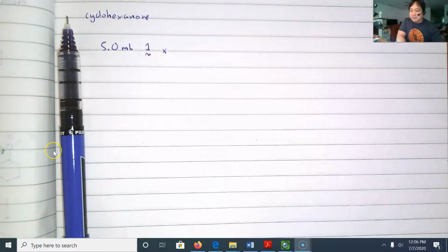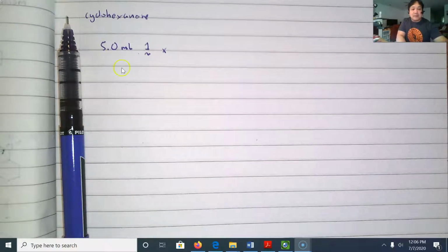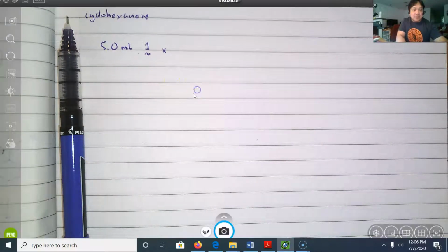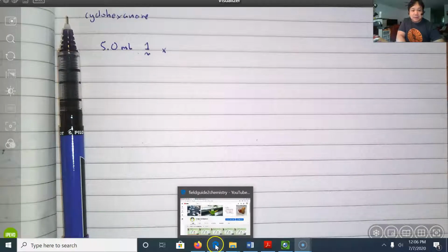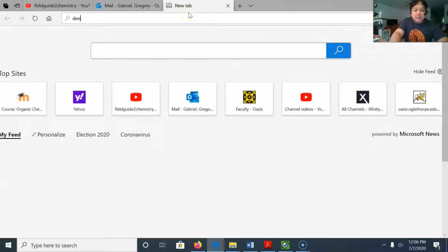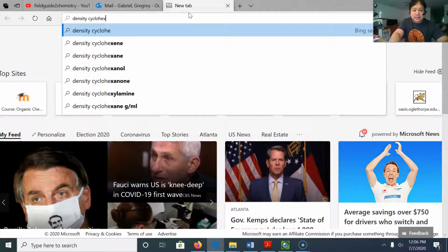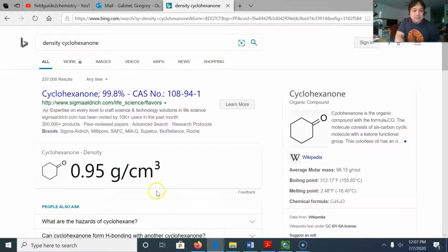Let me pick up some data because I need the density of cyclohexanone. Great.